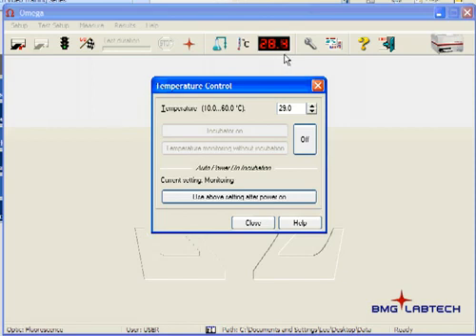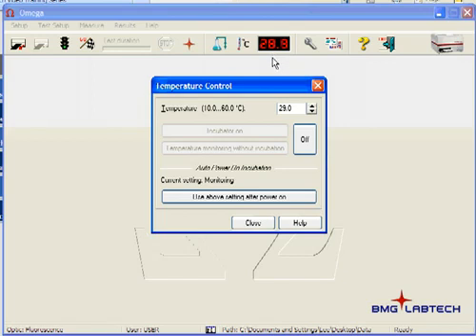You can see that it ramps up a tenth of a Celsius per second. So it's fairly rapid to increase the temperature up to the point that you're ready for.